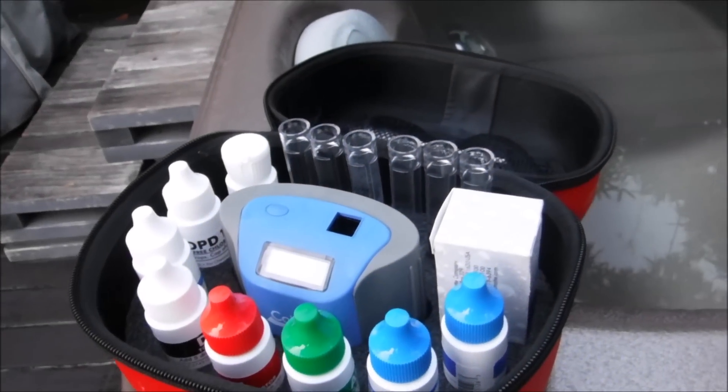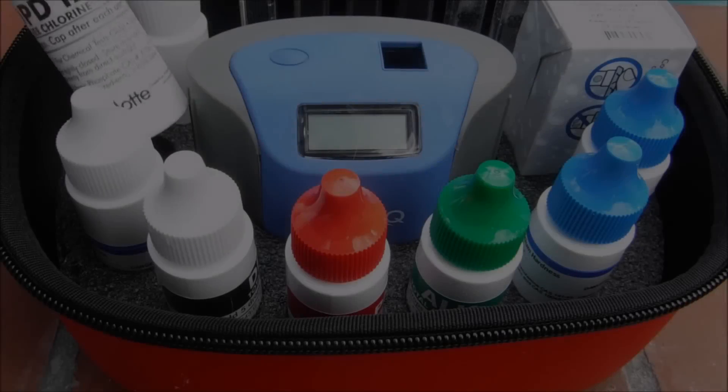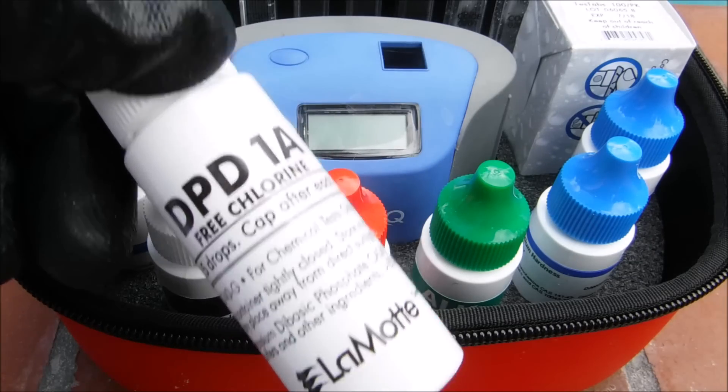So if you have a spa or hot tub, the ColorQ does the bromine test for you as well. I like these reagents because they're clearly marked for easy use.